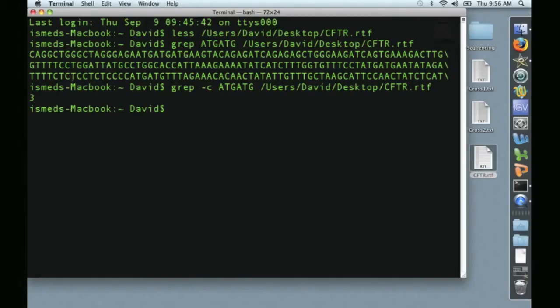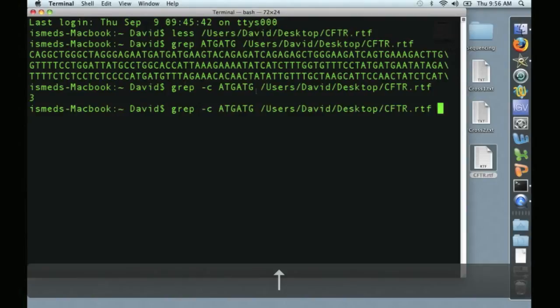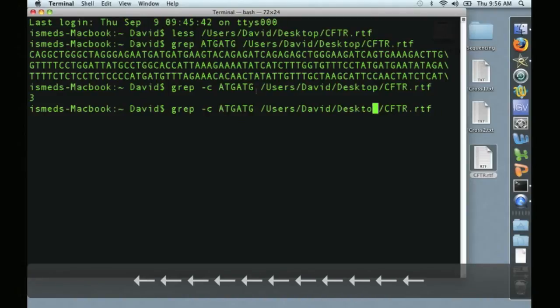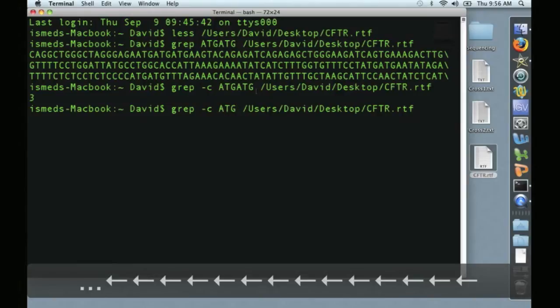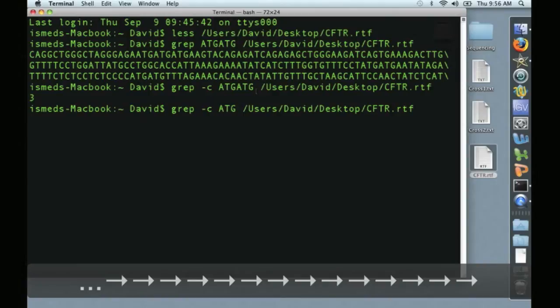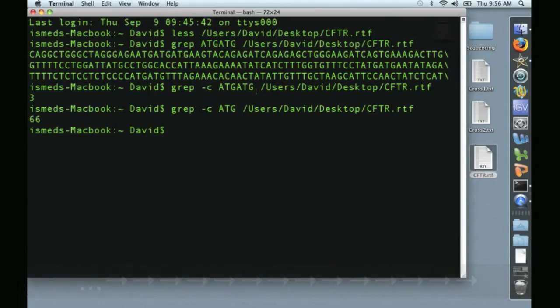Likewise, we could search for just how often the codon ATG occurs. Here's a handy little trick. Instead of retyping this entire line, I can simply press the up arrow, which re-displays the last line of text. I can scroll over here, change this to ATG, hit return, and we can see that ATG occurs 66 times within this sequence.